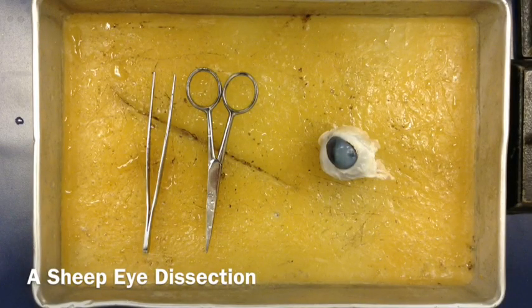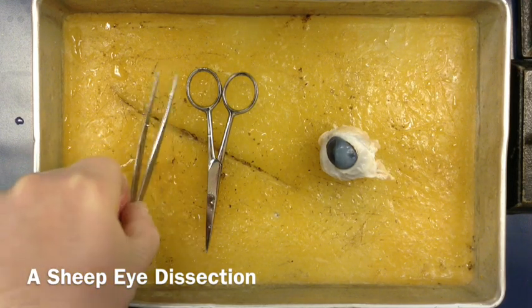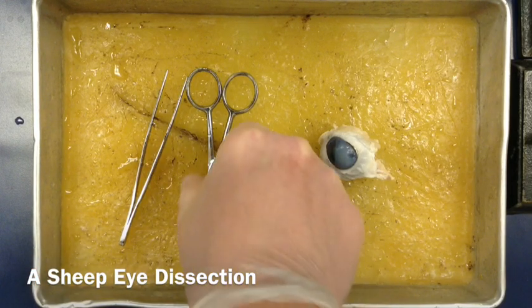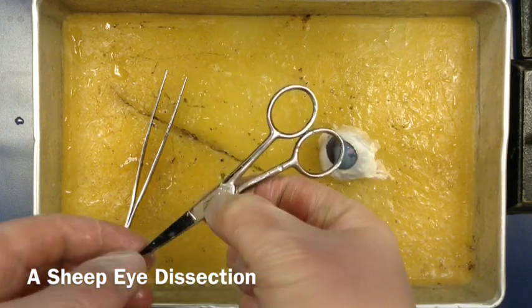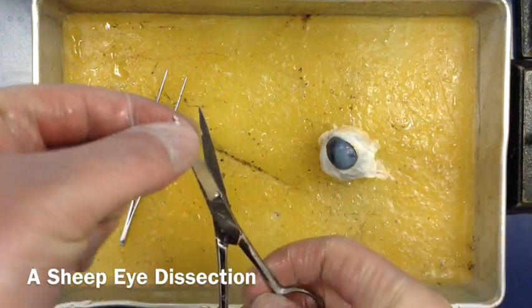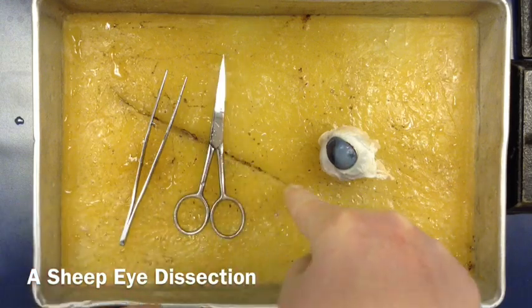We're going to do a sheep's eye dissection. First, we have a set of tweezers or forceps - we use those to pick up anything we need or pull things apart. Then we have scissors, which are actually much better than scalpels. Scalpels sometimes get a little too bulky, whereas scissors allow us to use the fine tip end to cut things open.